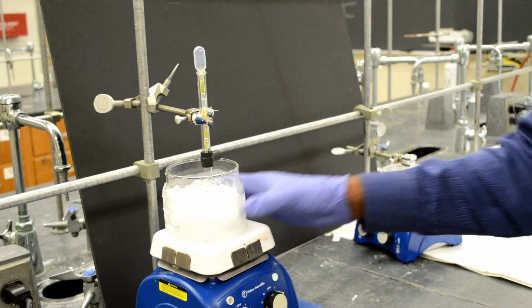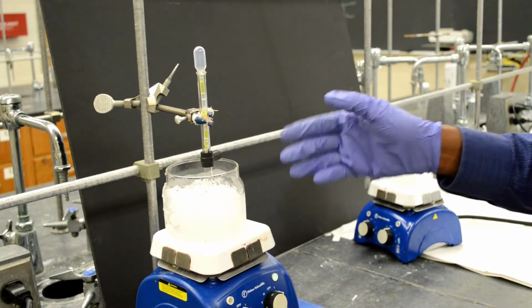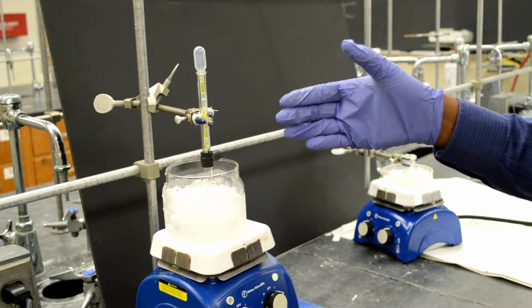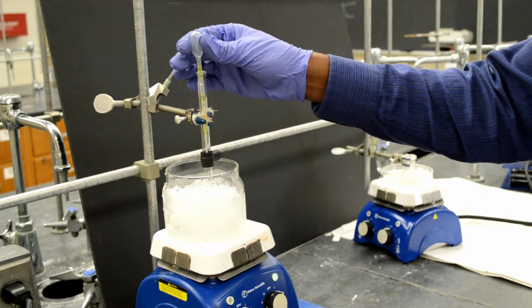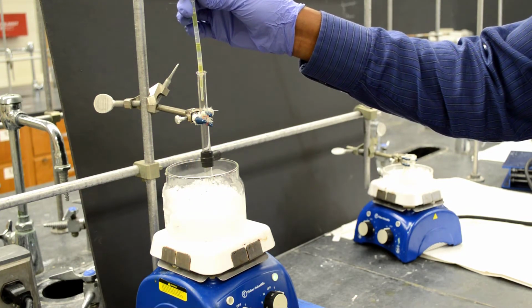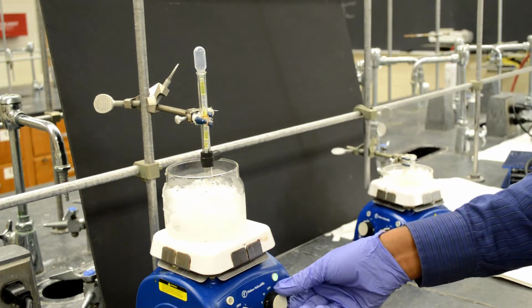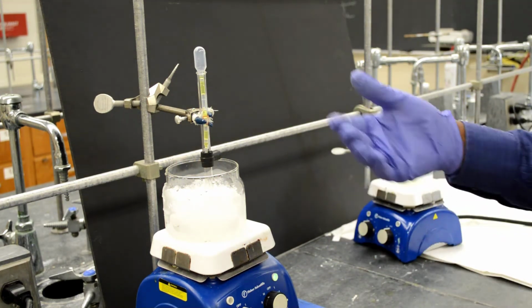We have an ice bath and we are adding it slowly. That way we can stop the exothermic reaction from going bad. Okay, so 1 drop at a time. 1 drop, stirring. Let's wait for 30 seconds and add another drop.